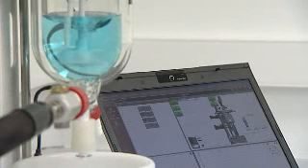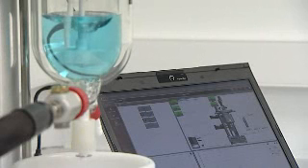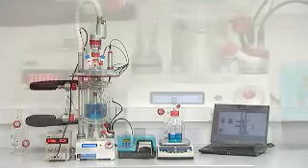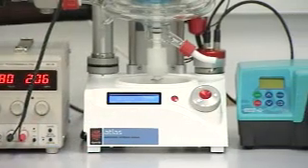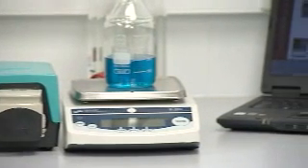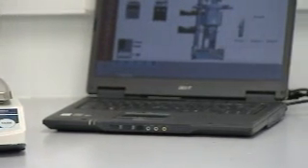Atlas software is an easy to use PC-based application for the control and analysis of experiments. Whole systems including Cirrus equipment and virtually any RS232 controlled apparatus can be configured and automated.